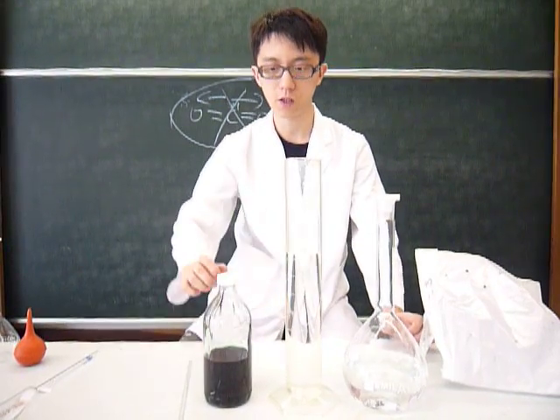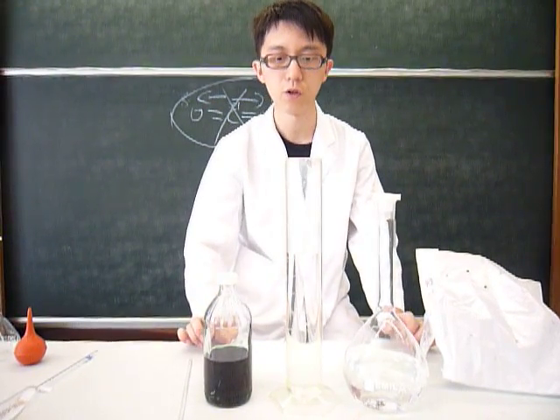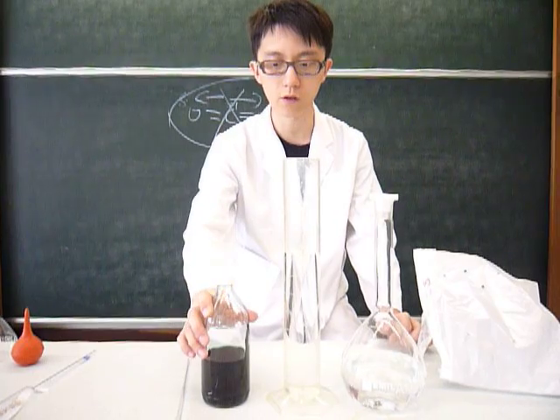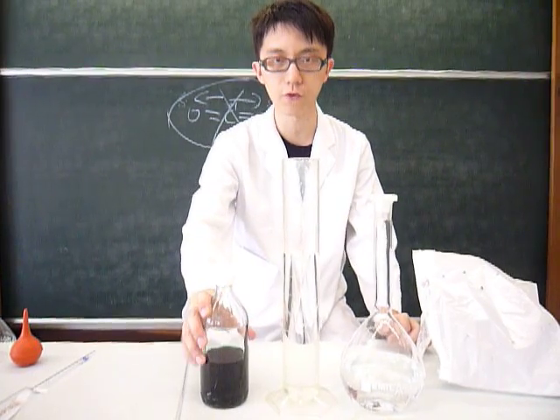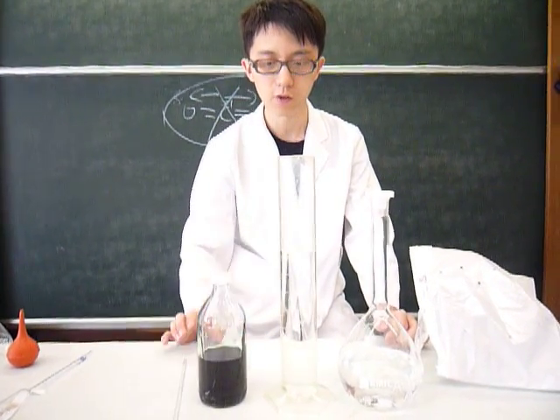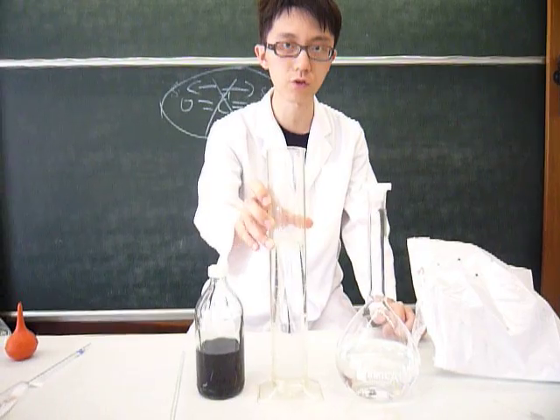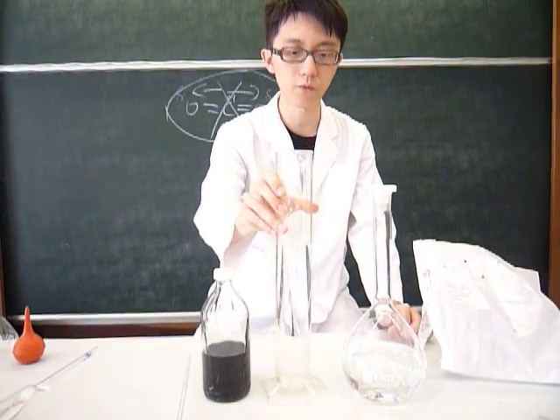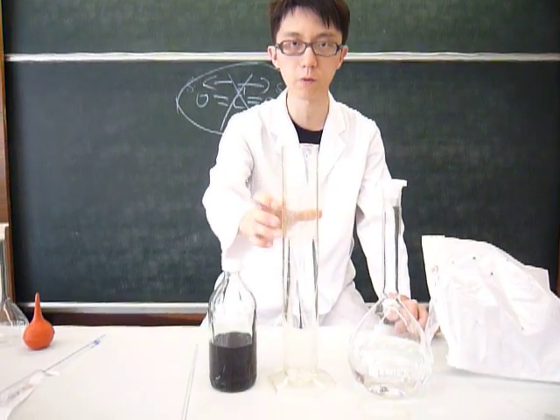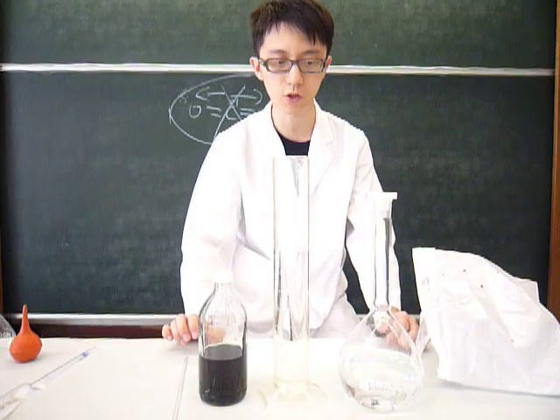Today we will do an experiment to find out the color change of the pH indicators. This is sodium hydroxide solution at a very low concentration, about 0.1 molar concentration.